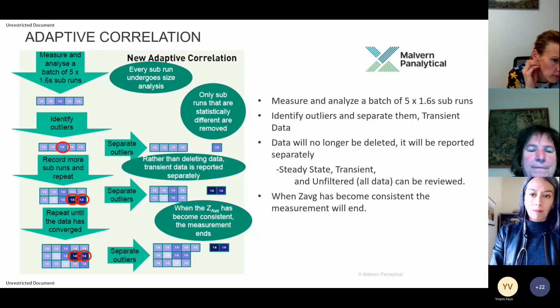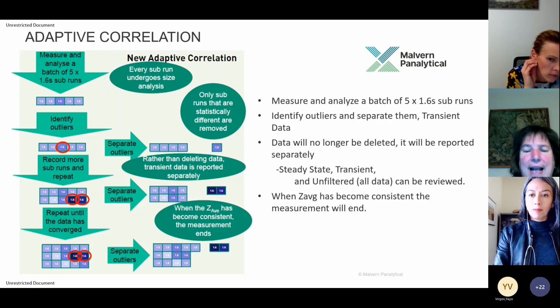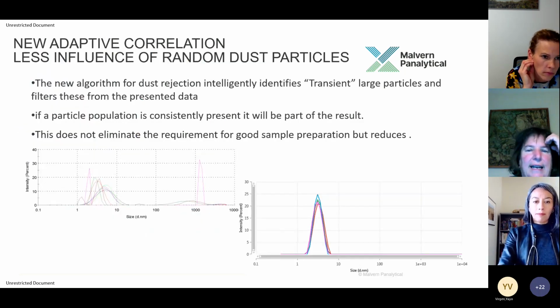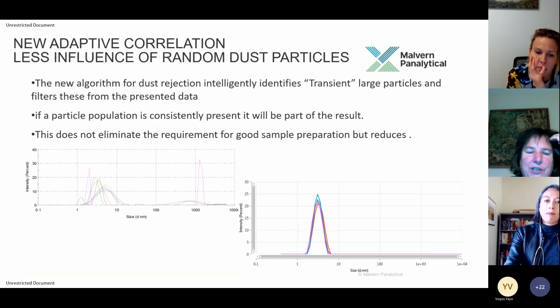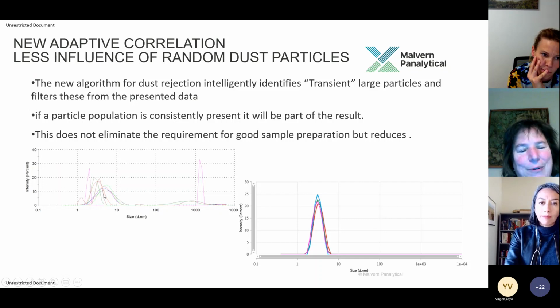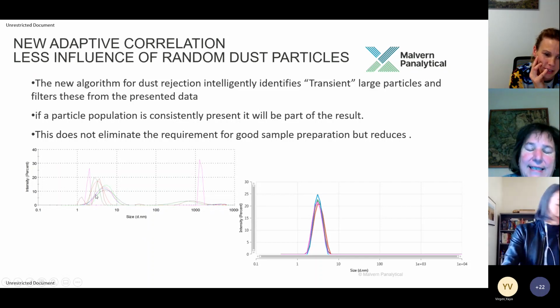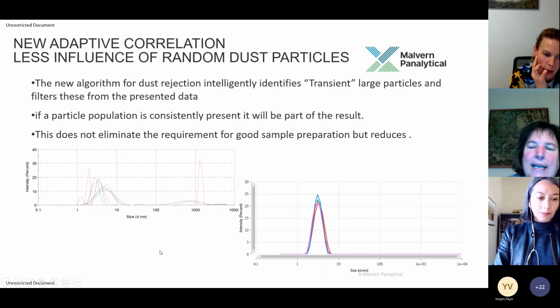And it's amazing how noisy data is removed, and you're actually going to see that. This is a protein measurement. And if you've ever made protein measurements, you know that they can be quite noisy. There's always some aggregates in there causing trouble. And like I said, the data is typically quite noisy.